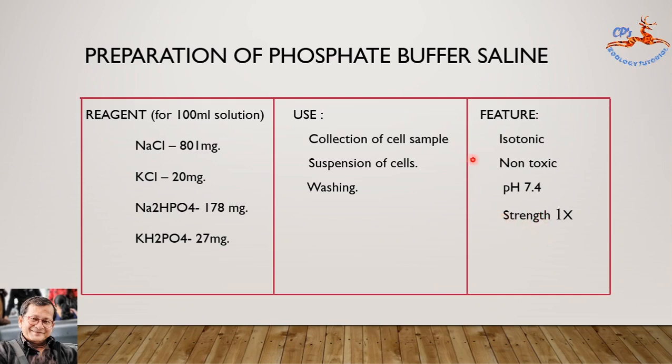So thus we have prepared the phosphate buffer, and we have to keep it for the staining of the cells in the second phase. In the second phase, we will make the cell suspension, stain, and count the cells with the help of these two prepared reagents.